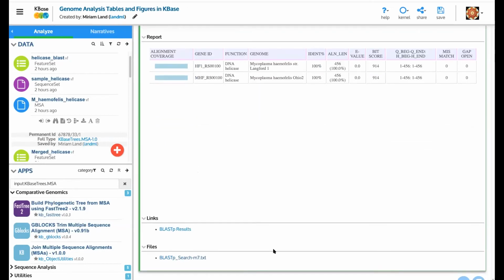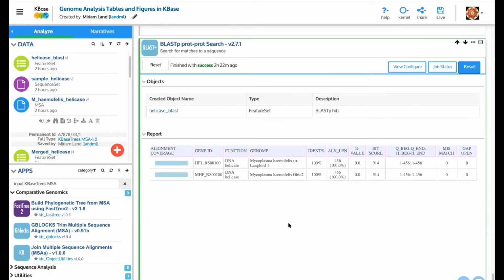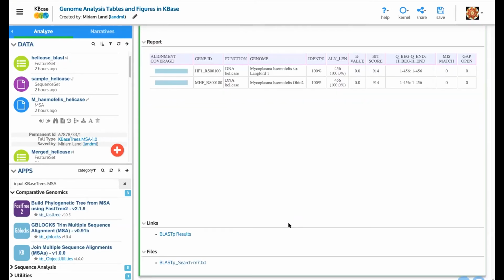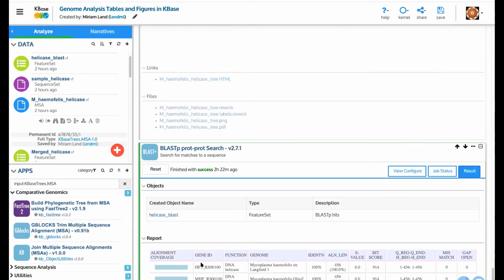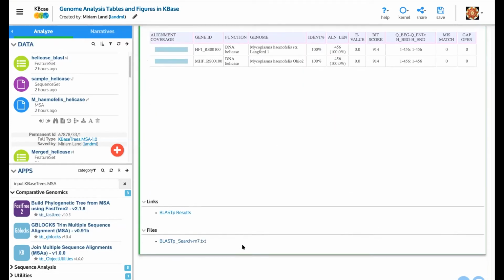And as with many of the others, there is a way to download. This would be a tab delimited text file that you could download your results into. And I haven't looked in a while, but I think this one actually has all of the results, not just the ones that pass the criteria here. And I think I am ready to pass it back to Ben.